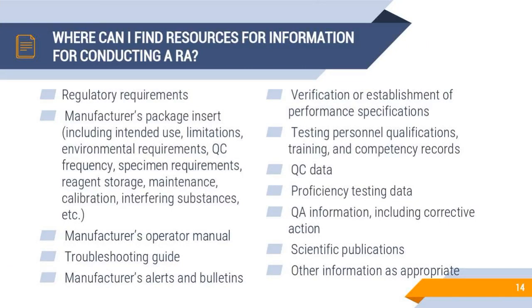Where can I find resources for information? If I want to do a good risk assessment and look for the potential errors, I have many resources or references I can look at: regulatory requirements, manufacturer and package inserts, where we have to pay attention to the QC frequency, specimen requirements, limitations, the manufacturer operational manual, troubleshooting guide, manufacturer alerts and bulletins, verification or establishment, which is the method validation, testing personnel qualification, QC data, PT data, and quality assurance data, for example audit reports or inspection reports, scientific publications, or any other appropriate resource.